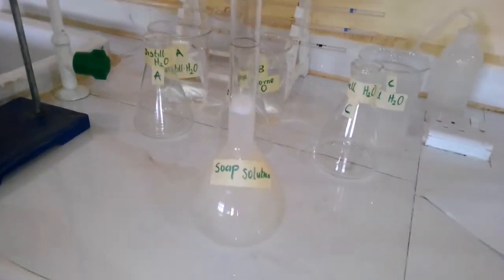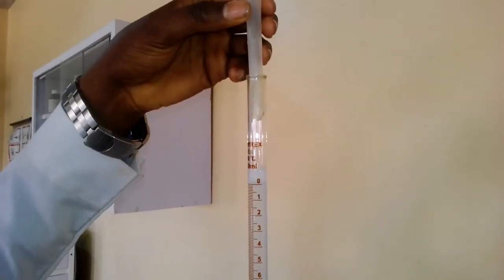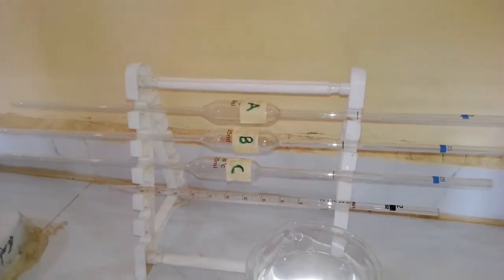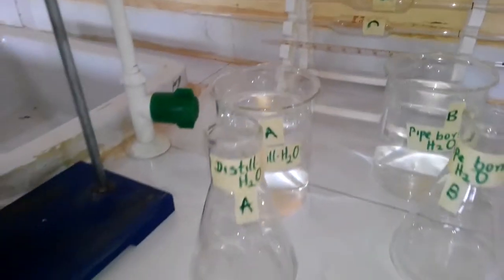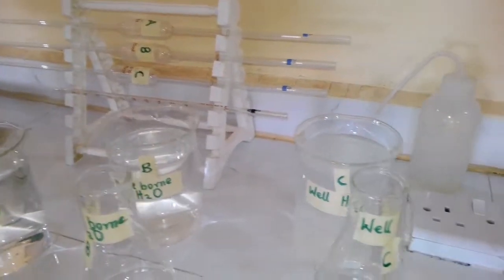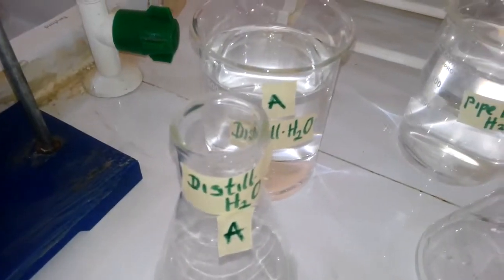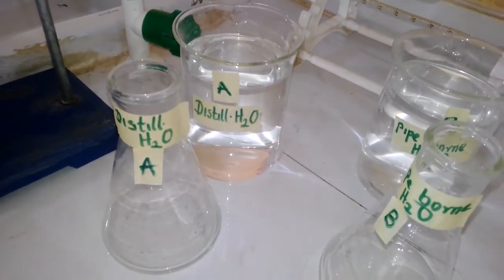Procedures. Step 1. Fill the clean burette with the soap solution. Ensure that the soap solution reaches the 0 mark point and remove your funnel. Here we have 3 pipettes. A is for measuring the distilled water, B is for measuring our pipe-borne water, and C is for measuring our well water. Start the titration with the distilled water, which is acting as the control.